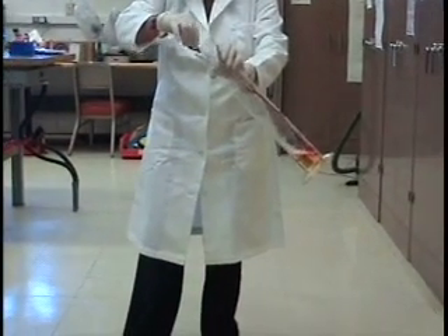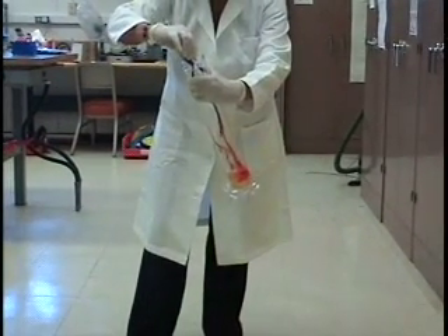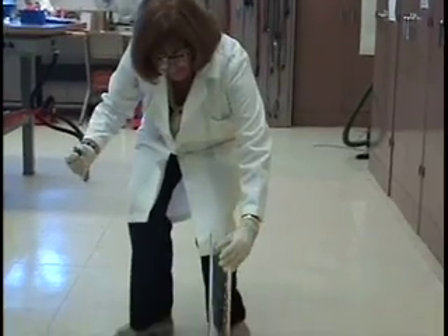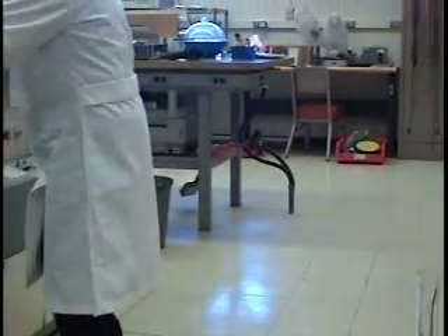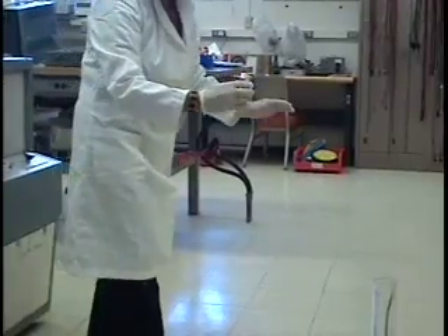This is a demonstration called Elephant Toothpaste. And all I'm going to do is add potassium iodide, which is a catalyst.